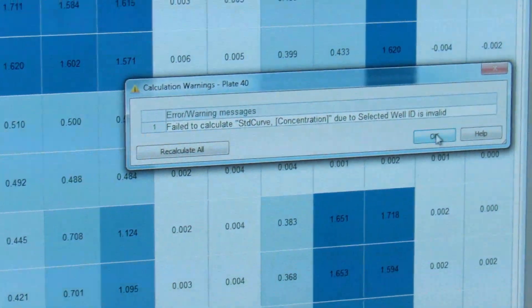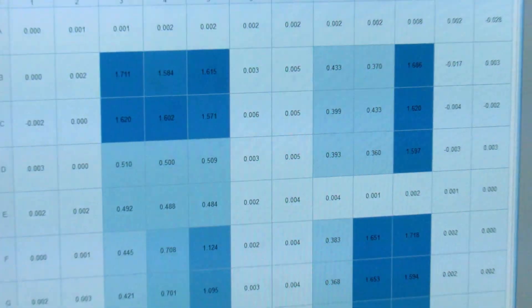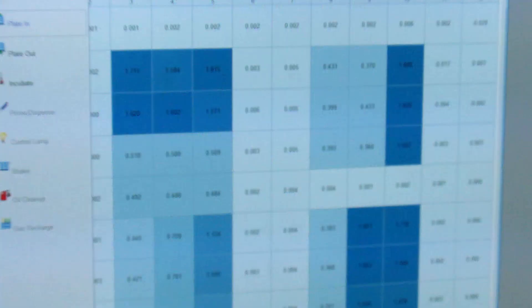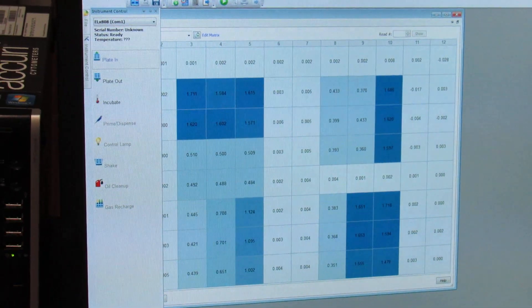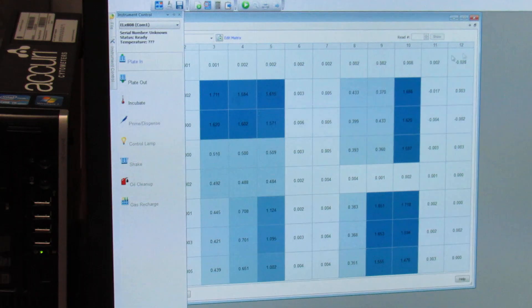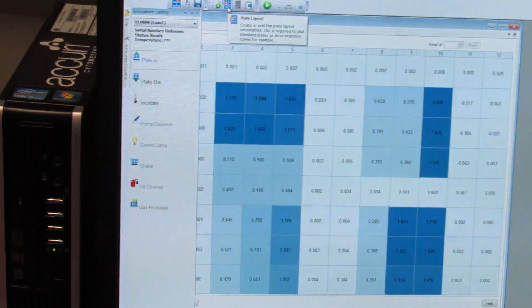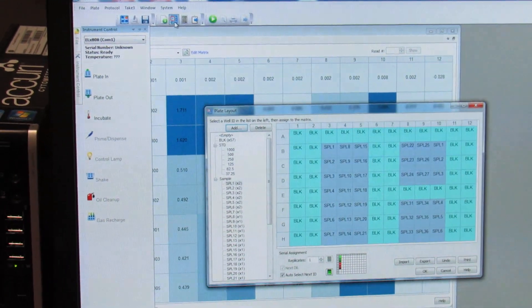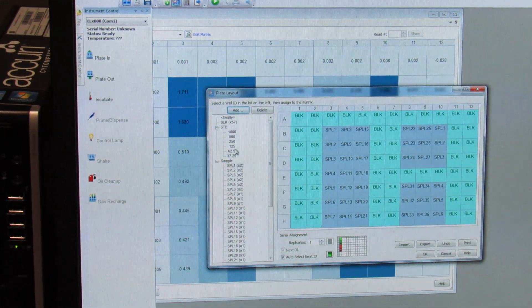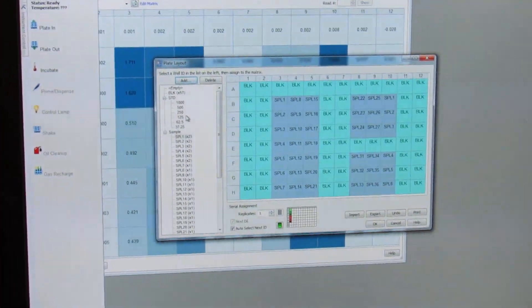After that, you can hit OK and you'll get the last used setup, however that's not going to be the same setup that we are using. So you'll scroll over here to Plate Layout and this is how you select how your plate is going to be designed.